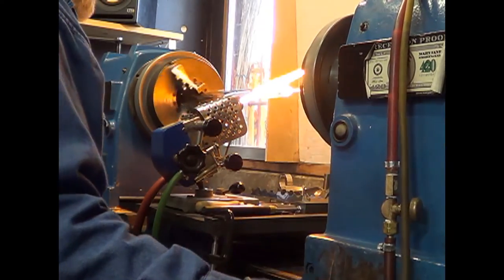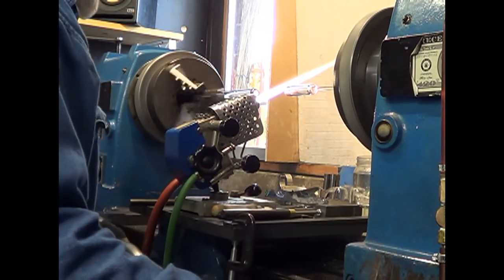Because it's turning in the lathe, it'll make a nice, round end.